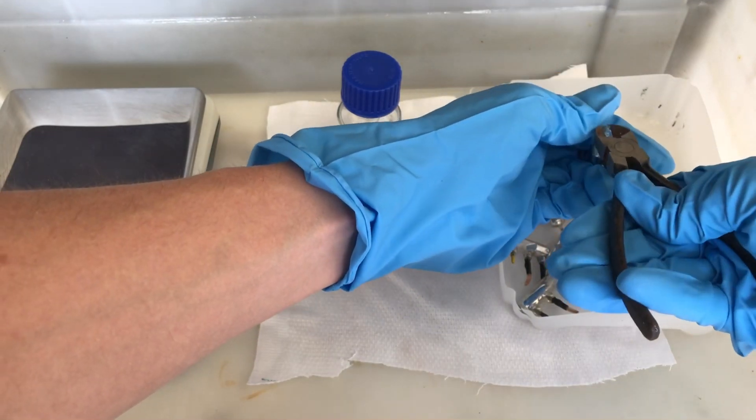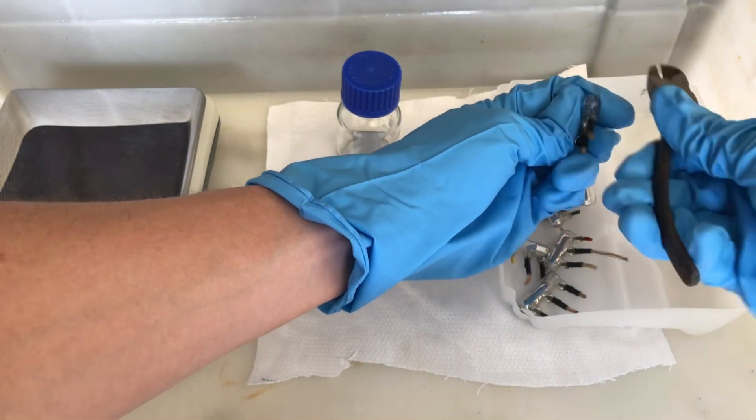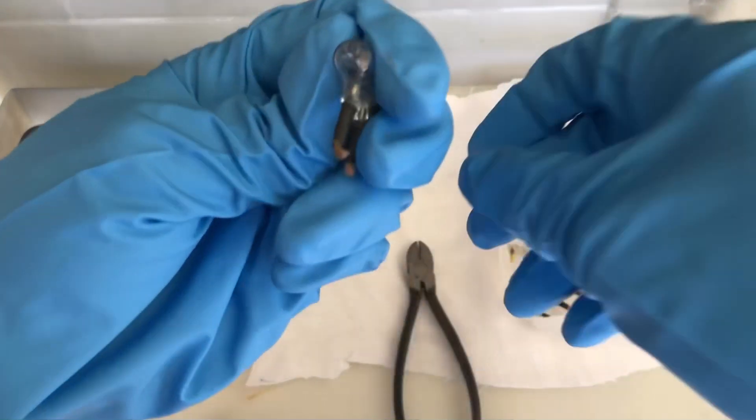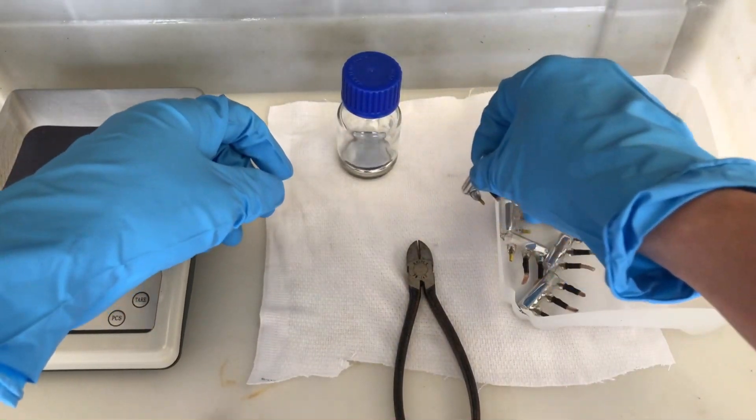You have to be very careful while doing this, because it is possible that the entire ampule is just going to shatter, spilling mercury everywhere. Therefore we also had a plastic tray below everything, just in case the mercury spilled.